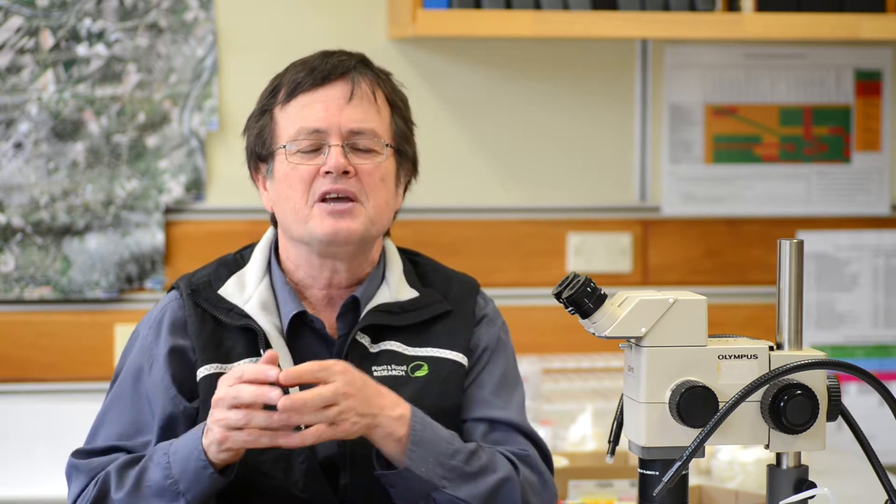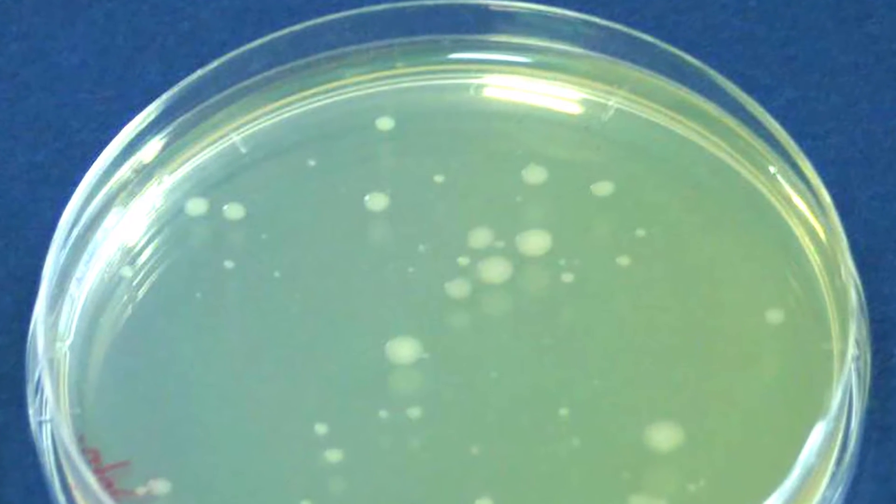The spores can appear on bees for a number of reasons. It might be contamination — some bees have drifted into the colony from another colony that has American Foulbrood, in which case there'll be low levels of spores. Or it might be because there are diseased larvae in the hive itself and the bees are trying to remove them and getting contaminated. We count the number of bacterial colonies on the plate, and if there are over a hundred, there's an 80% probability that the colony either has American Foulbrood symptoms now or will have disease symptoms if you check again later.